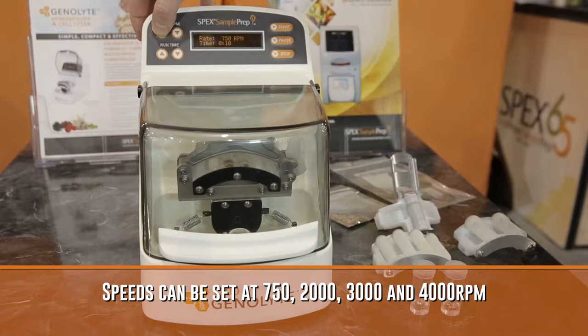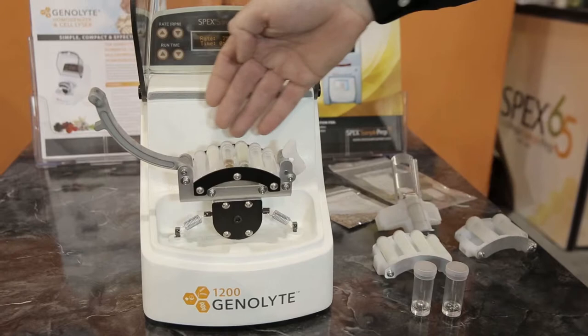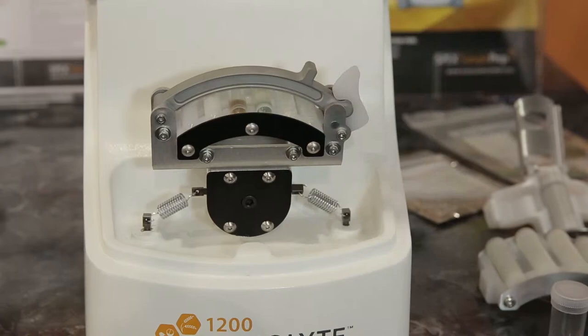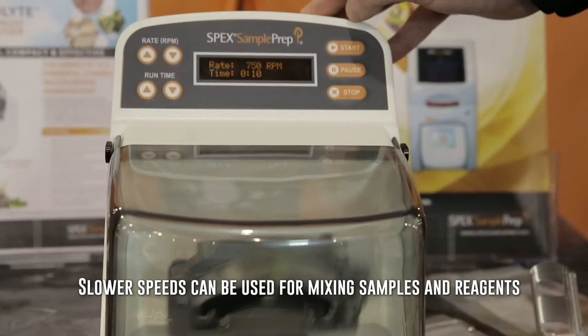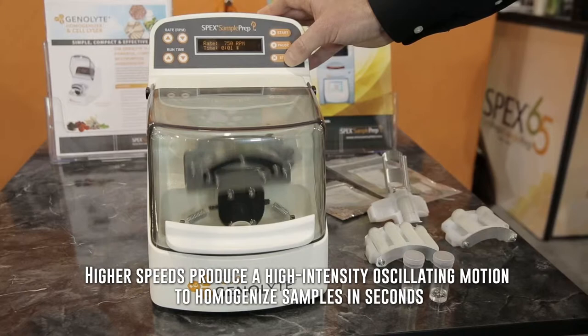We have our start, pause, and stop functions. The clamp is already loaded up with six 2 ml lysis tubes with the ceramic media. We have some examples of leaf tissue and seeds that have already been ground. We simply press the start button, and typically we're grinding or homogenizing the samples in 30 seconds to one minute for this particular sample type.